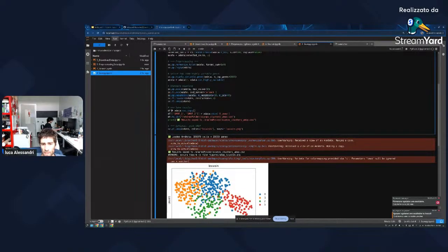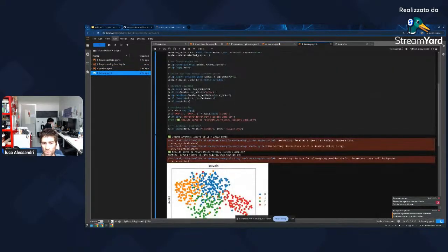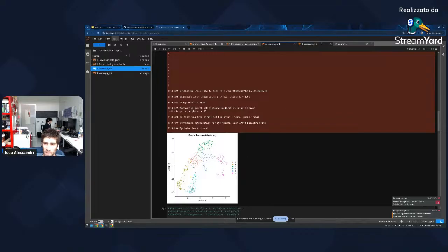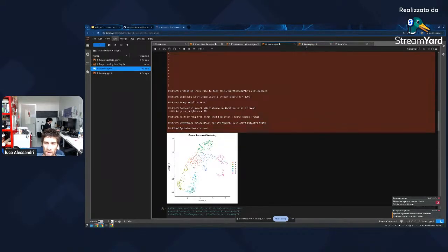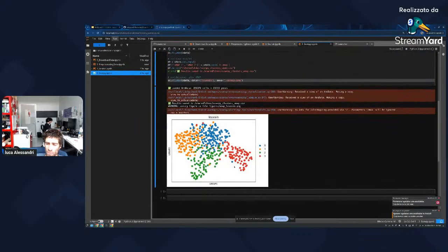And then, of course, you can save the results of the cluster, that will be kind of the same file as I showed here. And of course, you can use the UMAP to plot and project your data. And as you can see, I mean, the two pictures are not the same. And there is not really a strict way, a direct way to compare the data, the cluster obtained from this one and the cluster obtained from this one.